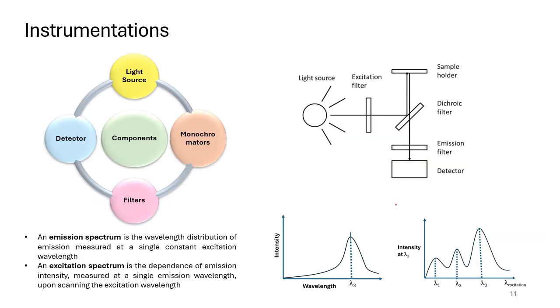Now let's come to the instrumentation. Most spectrophotometers record both the excitation and the emission spectra. Now, what are the emission spectra and the excitation spectra?